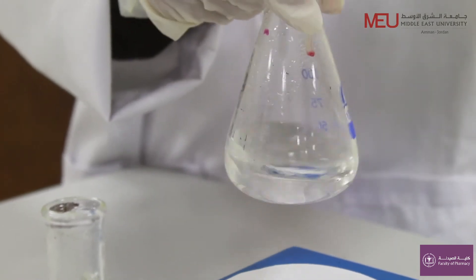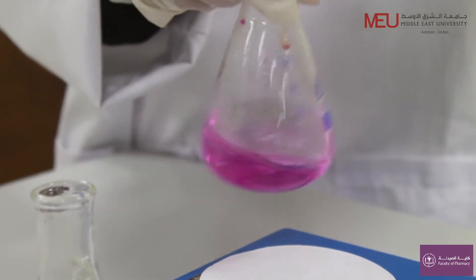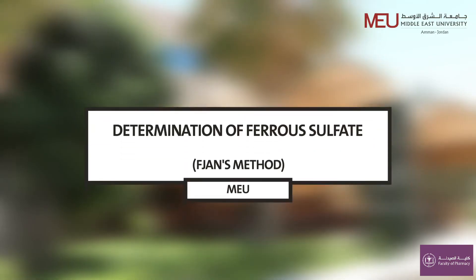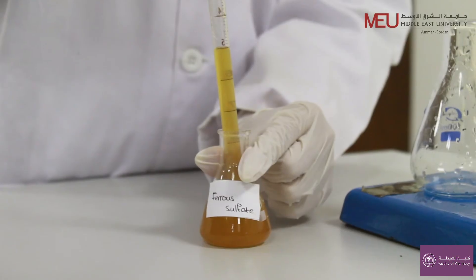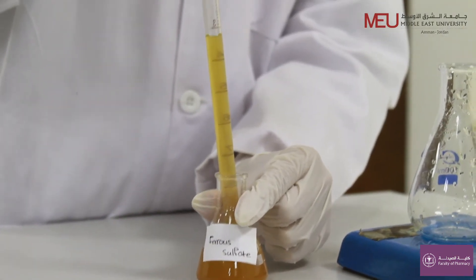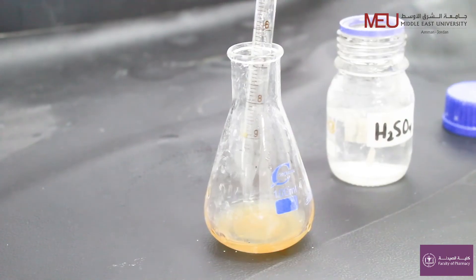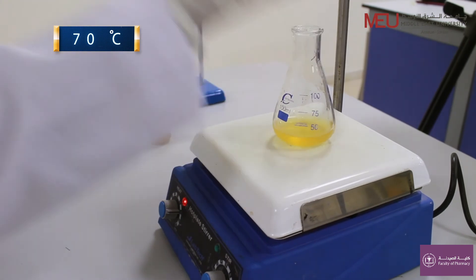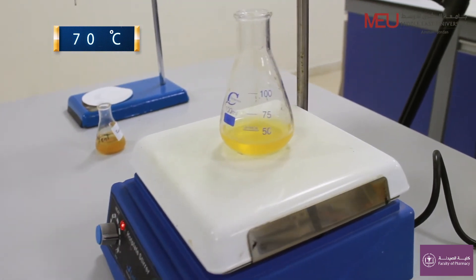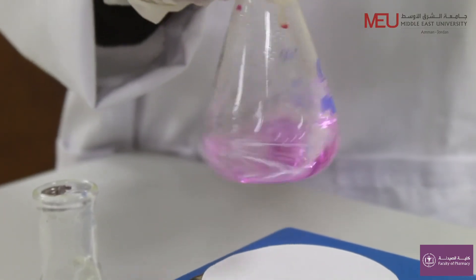You can now start your titration and find your readings. Add 10 ml of ferrous sulfate solution. Add 10 ml of 10% H2SO4. Heat to above 70°C to speed up the reaction. Take the final burette reading and start your calculations.